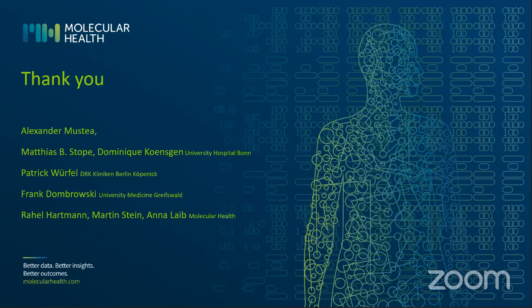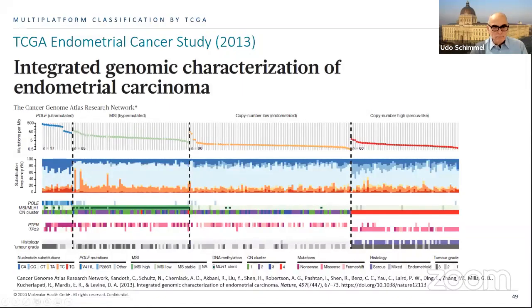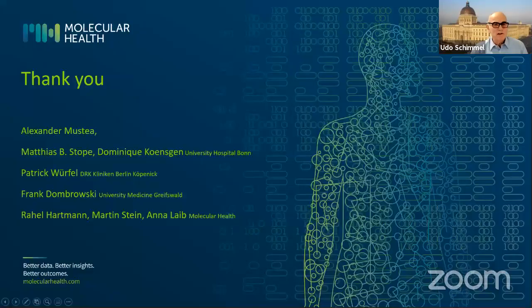We have heard in earlier presentations that they rely on a similar question on the DIN, the DNA integrity number, and with RNA on the RNA integrity number, the RIN number. Would you suggest a similar approach to look at those numbers? And if yes, what numbers do you consider okay, and which ones are not okay?